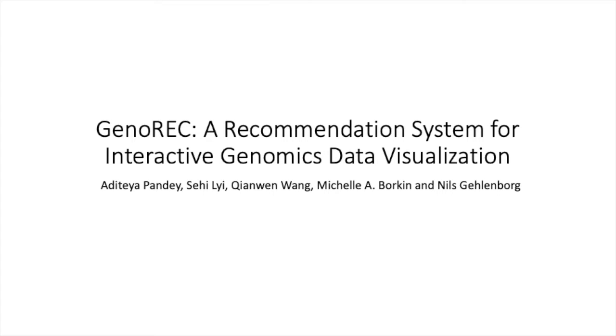Hello, in this video we demonstrate GenoREC. For the purpose of demonstration, we use the use case scenario described in detail in the research paper.